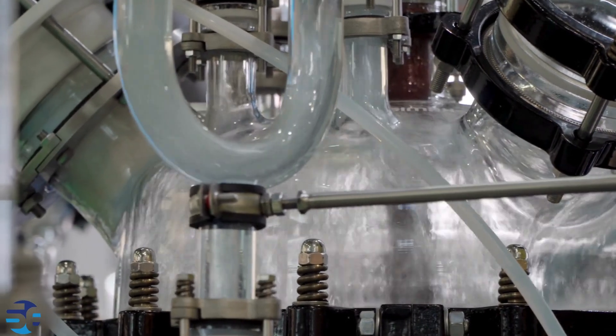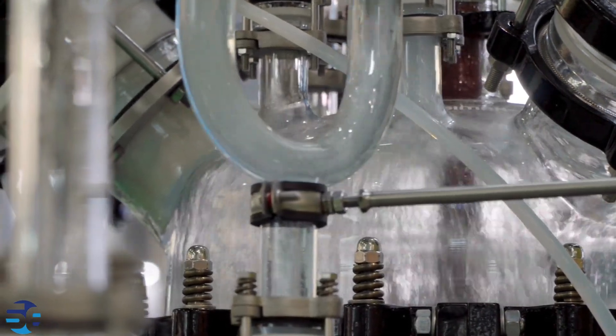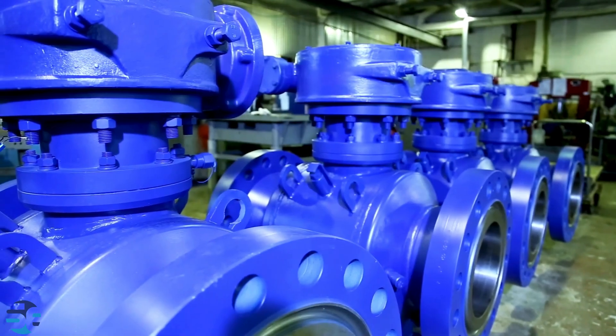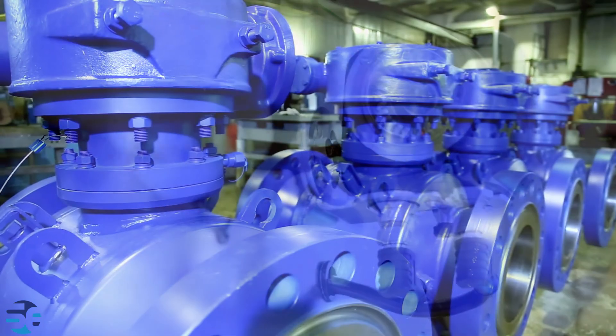For safety reasons, autoclave reactors are equipped with pressure relief systems to prevent overpressurization. This can include safety valves that release excess pressure if it exceeds the specified limit.